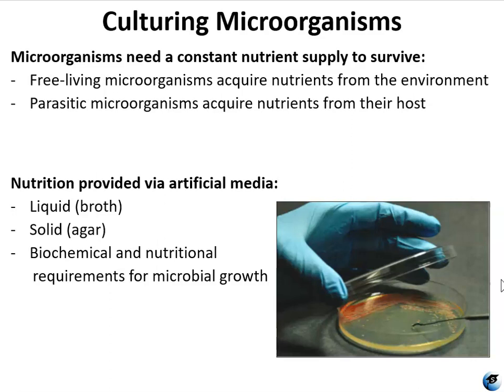But a con of that situation is that the bacteria will deplete the nutrients in a broth more quickly than they would in an agar. So it grows fast and it also dies fast. And you can tell that you have growth in a broth culture because the liquid will become cloudy, and the term for that is turbidity. If a broth is turbid, it is cloudy with microbial growth. And remember that broths are great for culturing, but they can't be used for isolation.